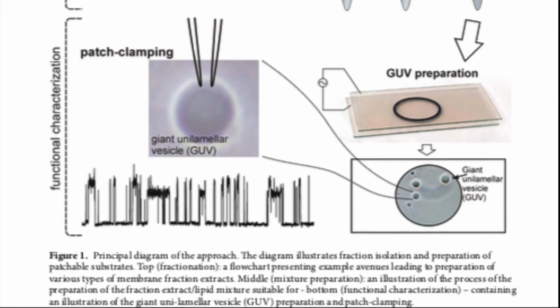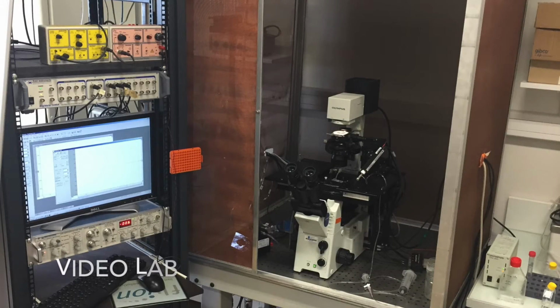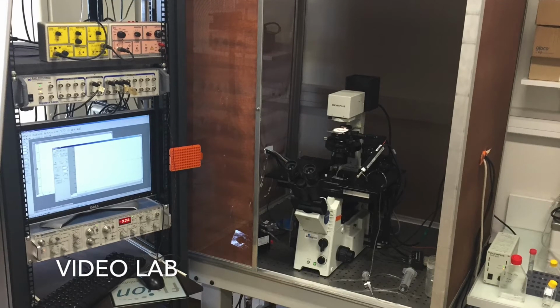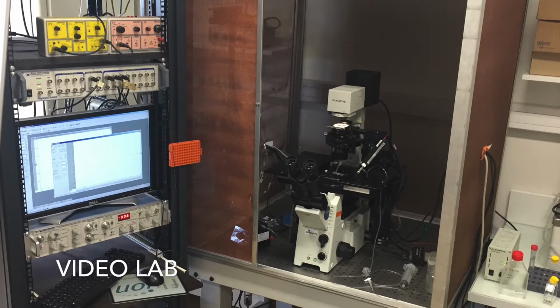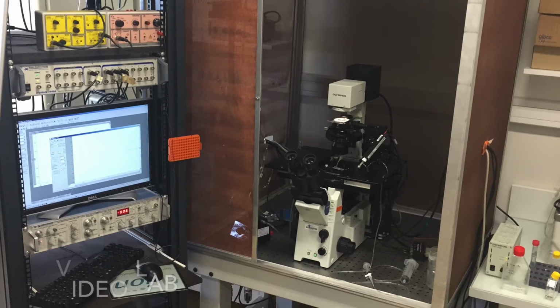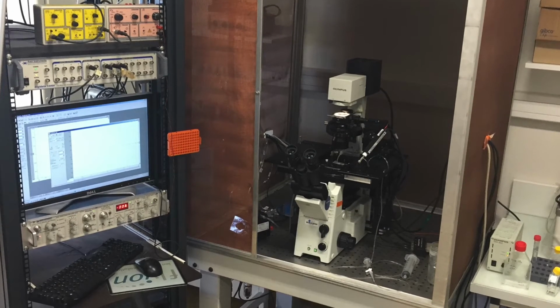Then we apply classical patch clamp techniques on it. We will now show you the patch clamp techniques in a real lab experiment in the Ficelle lab of Lille University with Antoine Faucheur. In the team lab, they use two cell lines that are prostate cancer cell lines from bone metastasis, C42 and PC3.